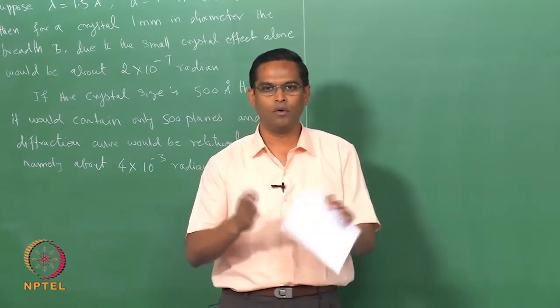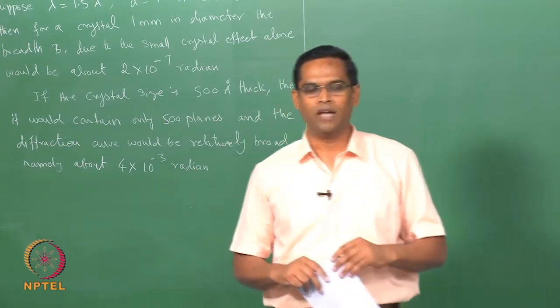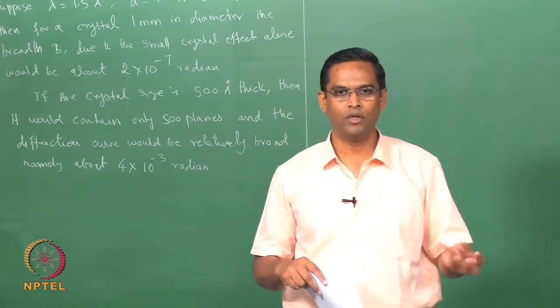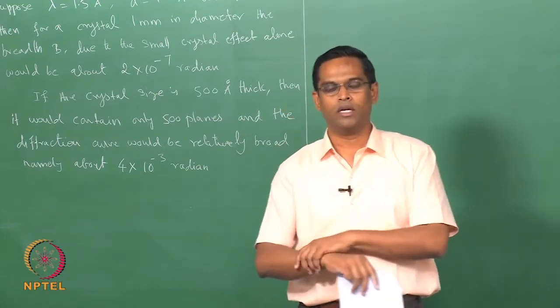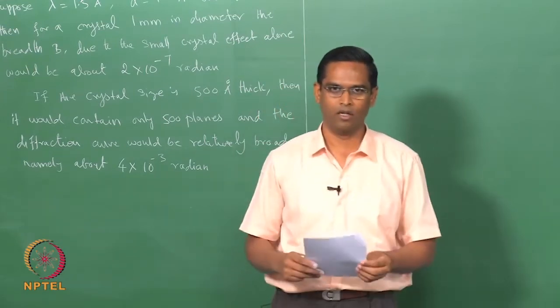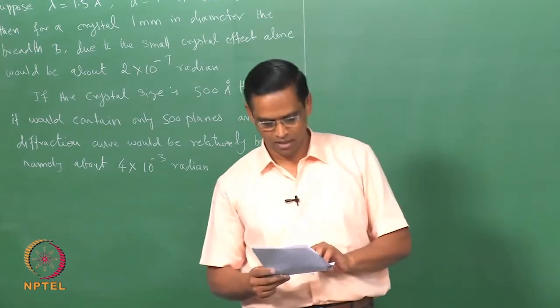So, you have to visualize that we are now talking about diffraction coming from a polycrystalline material, which contains units of single crystals or grains, and we are considering diffraction coming from 2-3 different grains all together. With this background we can discuss the effect of strain also.